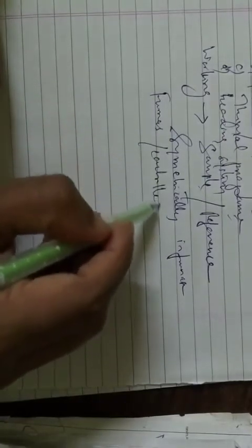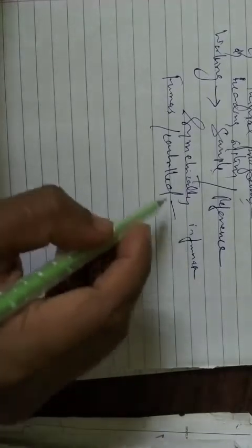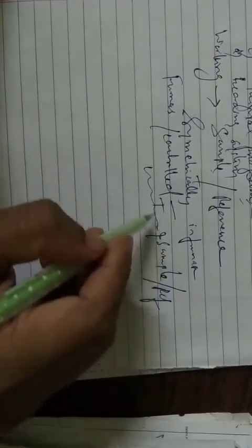The furnace is controlled under a temperature program, so the temperature of the sample and the reference are varied with the help of the temperature controlled machine. And during this process the differential thermocouple is set up.